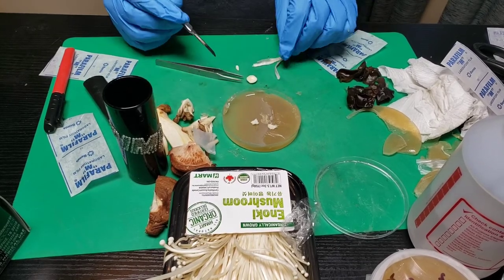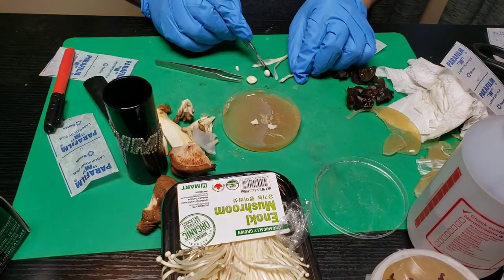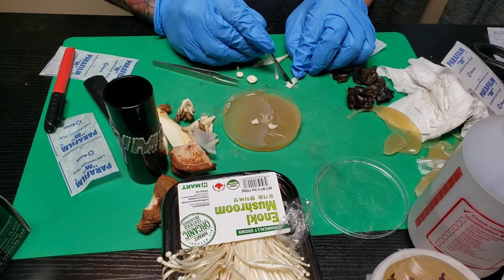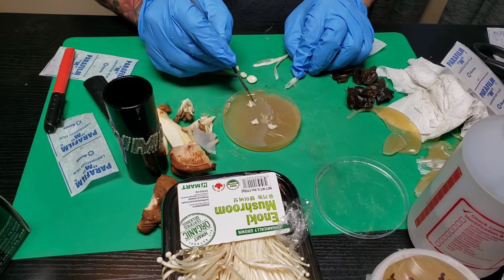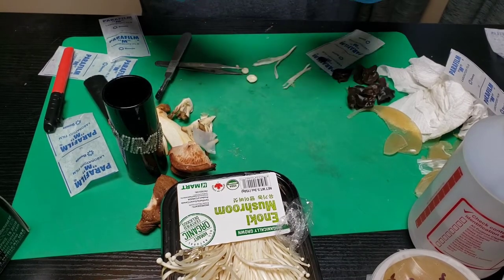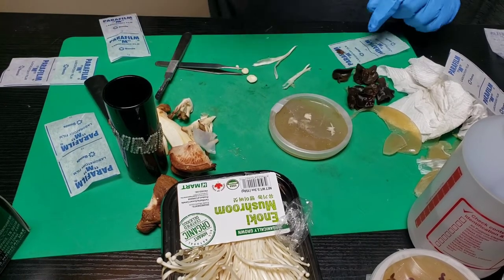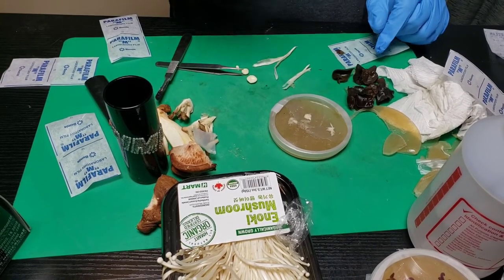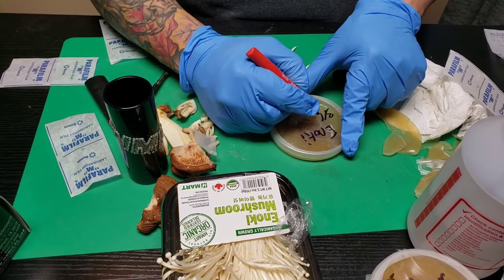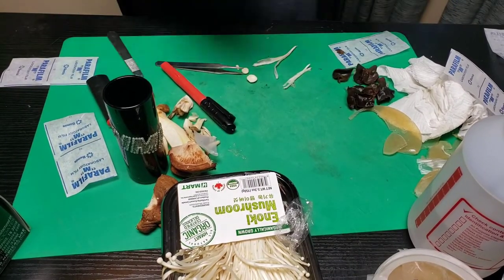Let me grab another one and try to pick a big one. Same thing — I'm going to cut the cap off, split it down the middle, and just scrape a little bit out and put that in there. I'm going to clean all this up, break open my still air box, and finish the rest of these up. If you stay to the end of the video, we're actually going to do something different and make a liquid culture. This is enoki, 3/16/2020.